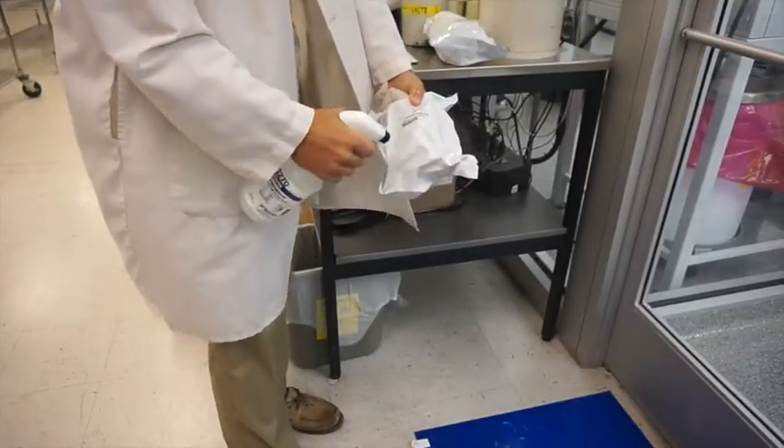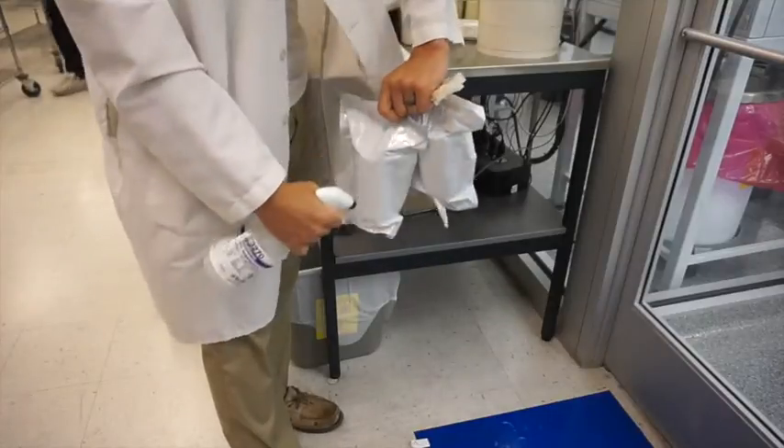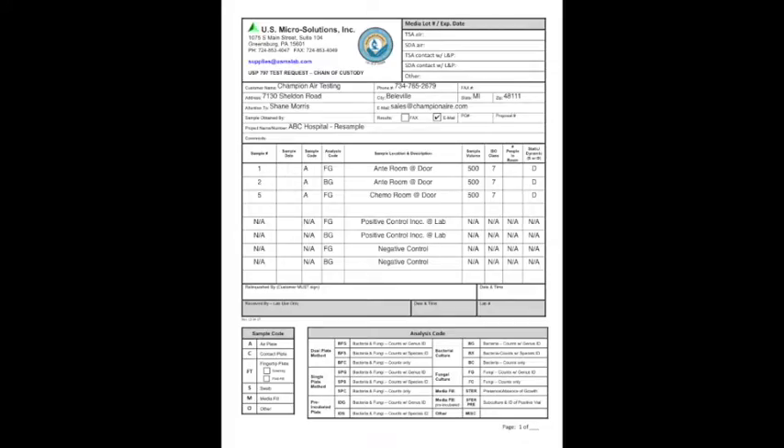Also remember to wipe down the sleeves of media before taking them into the clean room. Inside the resample kit you also have a piece of paper that is a chain of custody, and this is to show the micro lab exactly what locations were sampled, how much volume, project name, and some of the basic info. This is the sheet that you guys are going to follow.